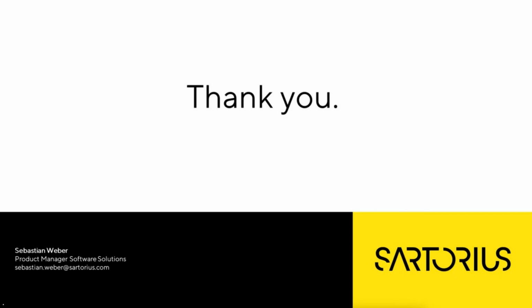Great. All right. Next question here. What happens if the connection to the file share does not work? Will the data be deleted? Okay. If the connection to the file share is interrupted for whatever reason, it will generate an error message. And you will be given options. You can retry, you can redirect, or you can cancel. But the data will not be deleted. The data will be saved into the ring memory of the balance until this connection is remade. So from that perspective, it's quite secure.